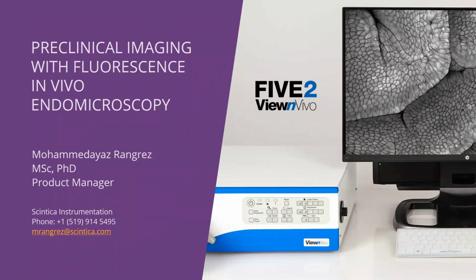And the session will include, amongst other things, a hands-on demonstration of the system and an overview of various preclinical applications supported by sample images from a variety of animal models and tissue types.